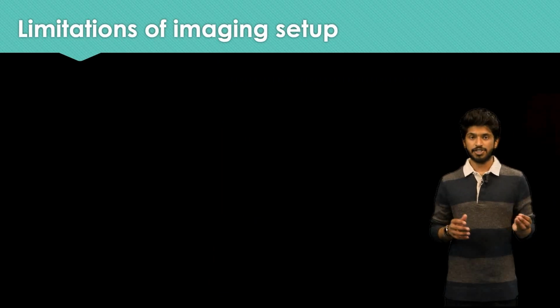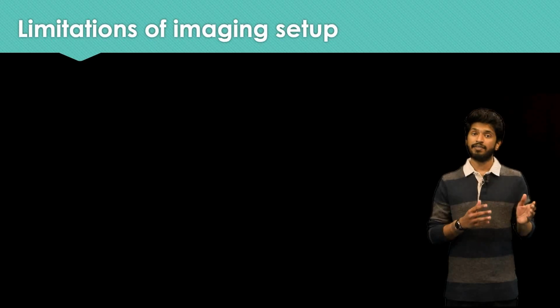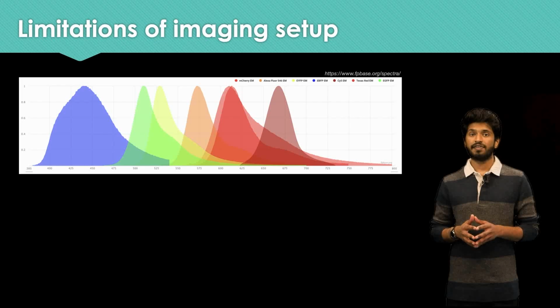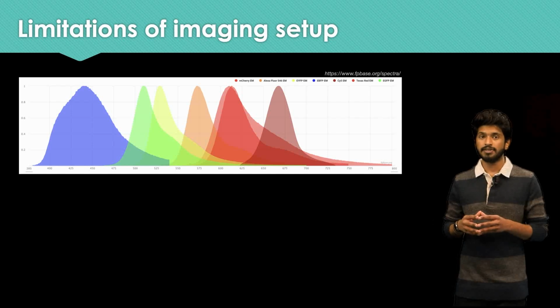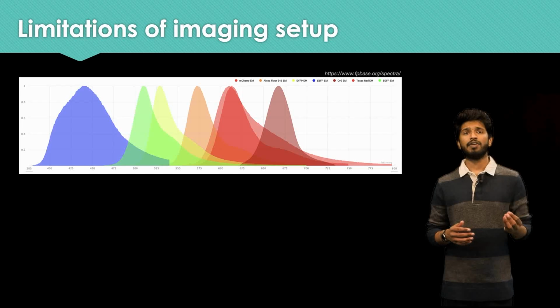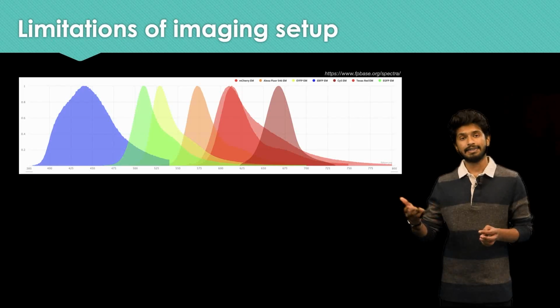Once the setup has been chosen, it is important to understand the limitations of your setup before making any hypotheses and understanding the event very clearly. Each channel or wavelength is different to one another, as only based on the wavelength can the depth of the image and resolution be determined as previously discussed. Due to this, it is crucial to have a control prior to your imaging experiment to understand if you could actually image the sample at that depth.